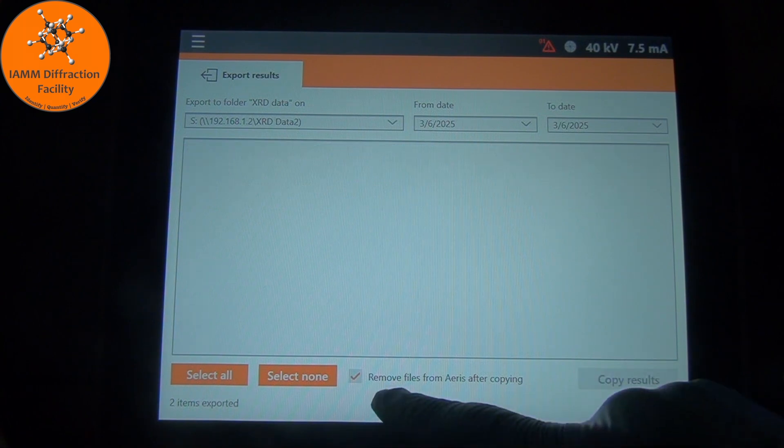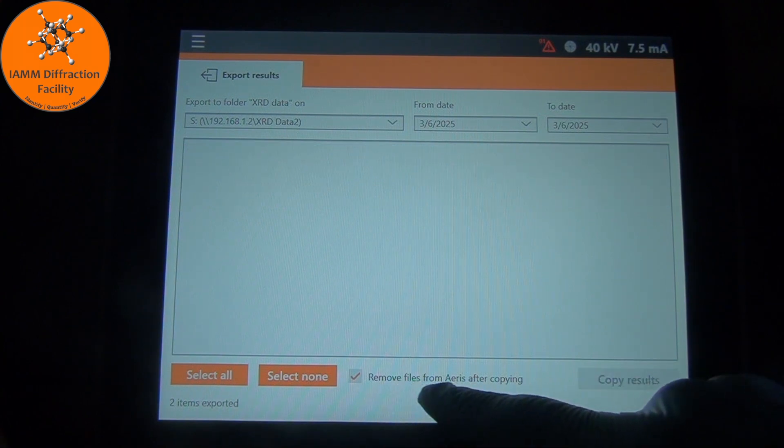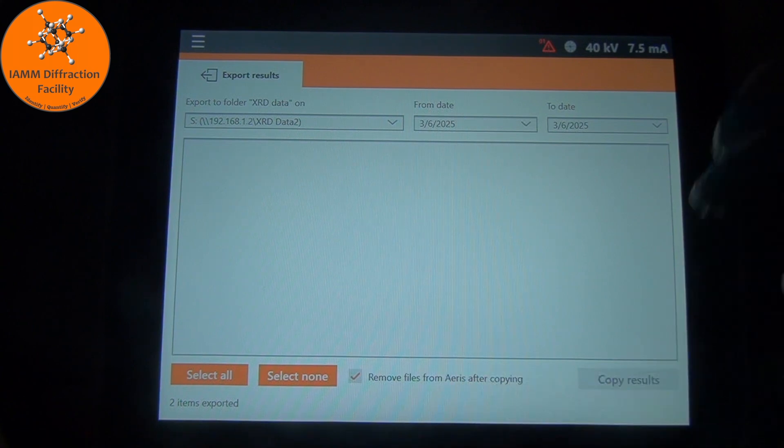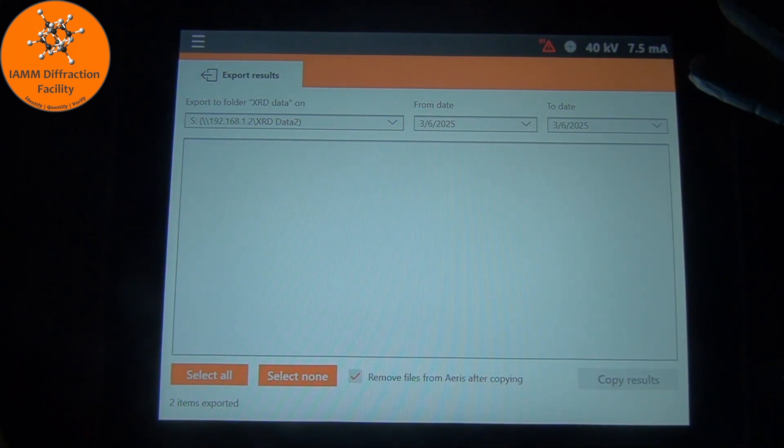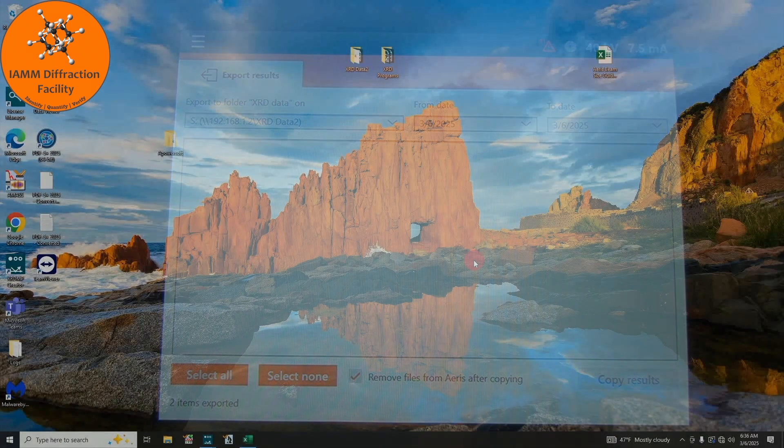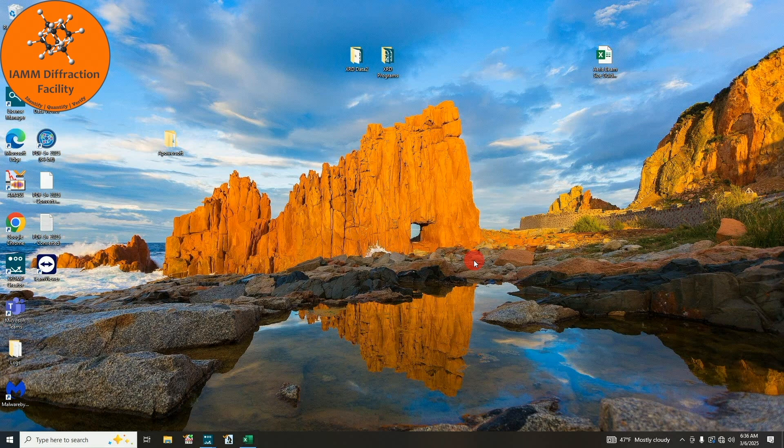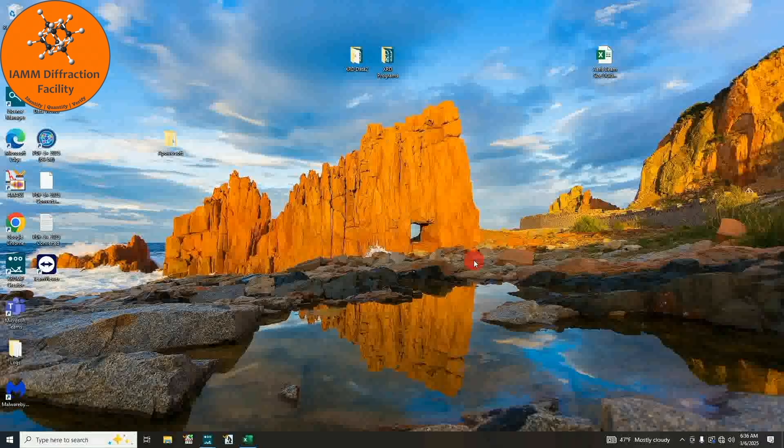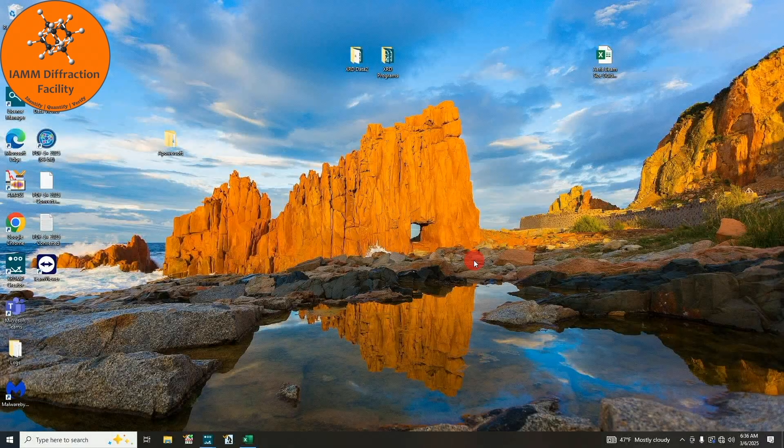All we need to do then is simply click copy results. Because this button was activated, the files will be removed from the ARIS after copying to the computer. That's what we want to do because I don't want this to be loaded up with a bunch of files.